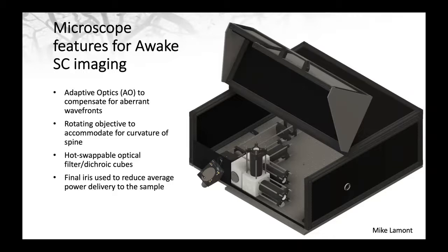In yesterday's talk, we talked about how myelin is quite scattering because of all the lipids from the Schwann cells that are wrapping the spinal cord and wrapping the axons. And that will generate a lot of third harmonic generation.